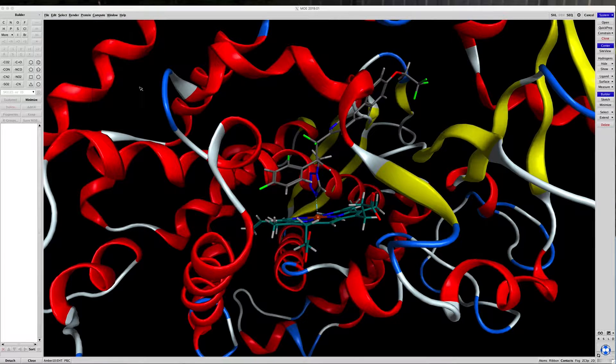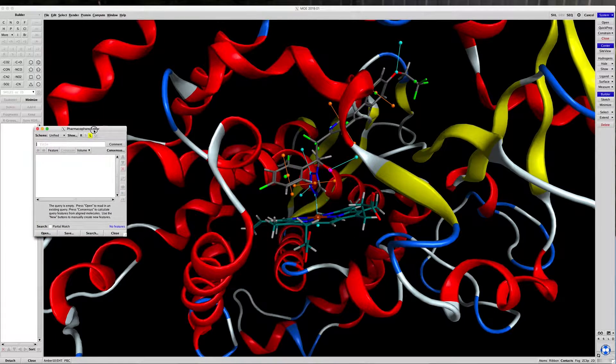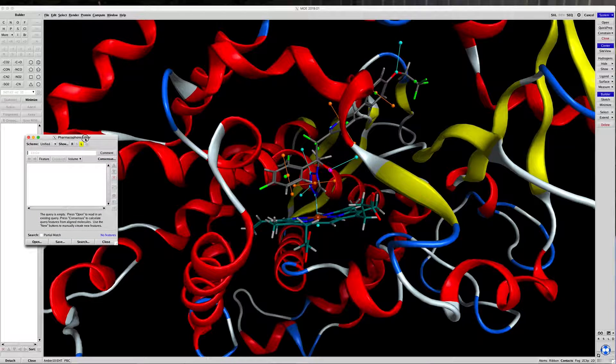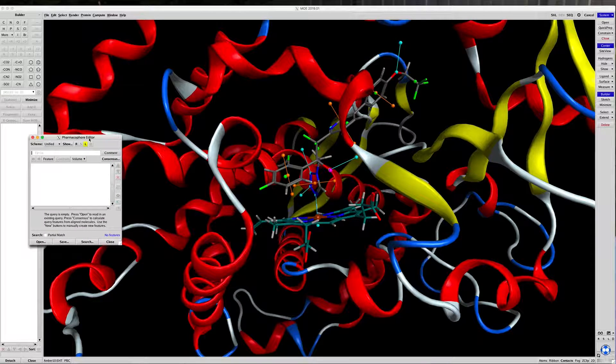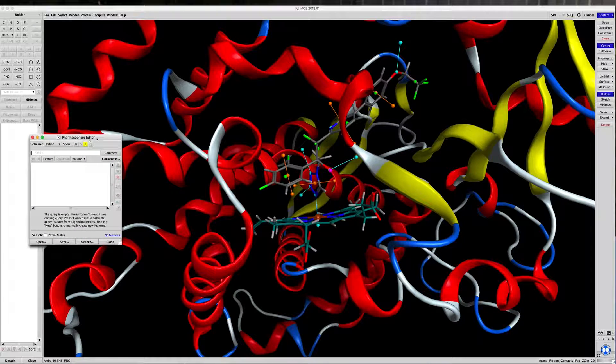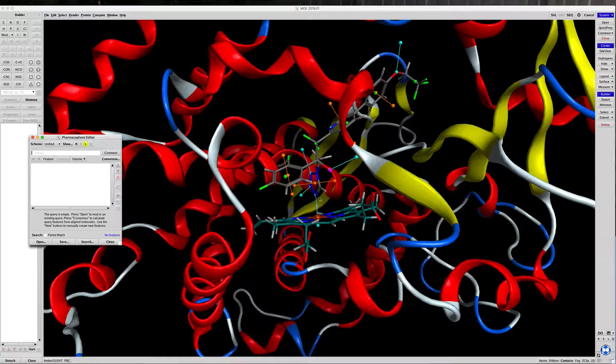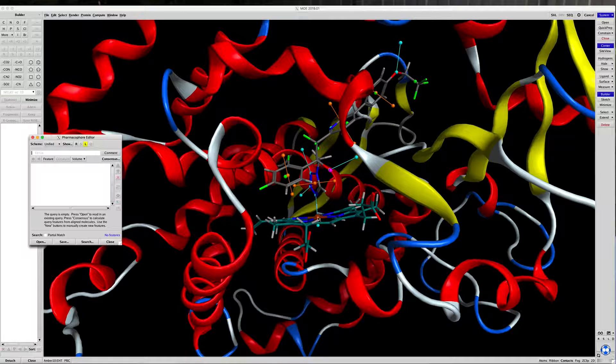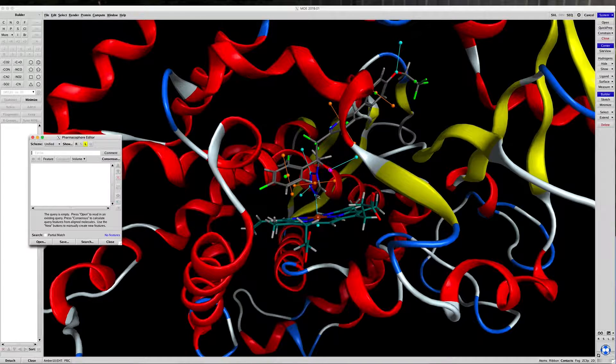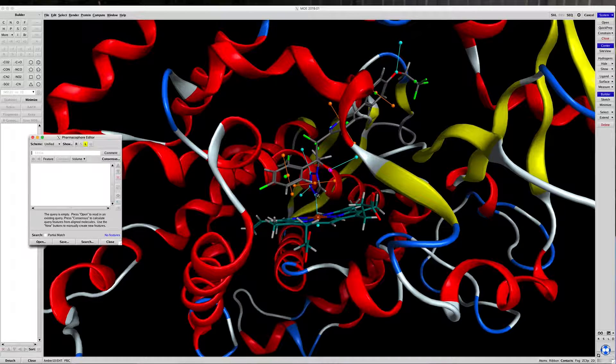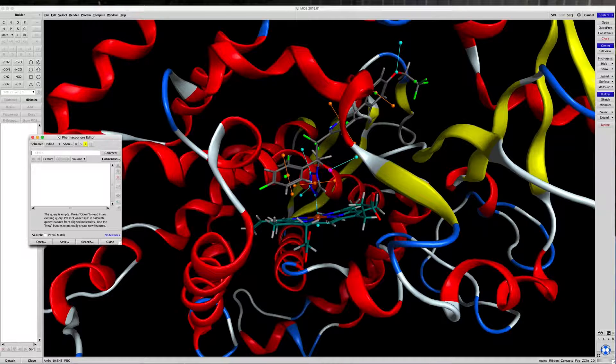And you'll see some vectors show up in your model here. What we want to do is create a pharmacophore that associates this 4-nitrogen here with the iron.